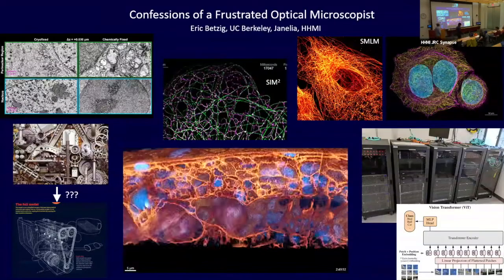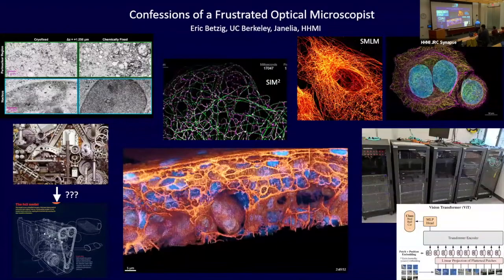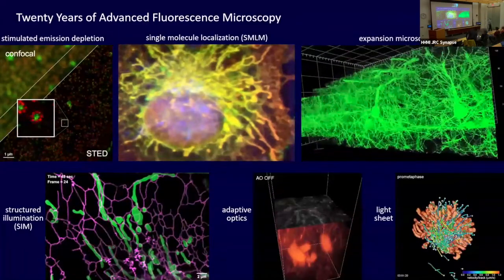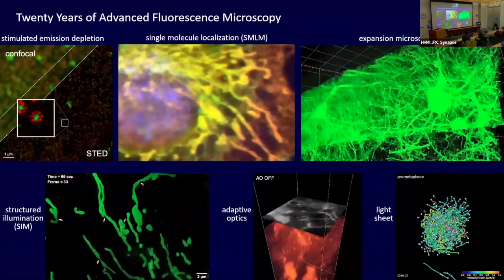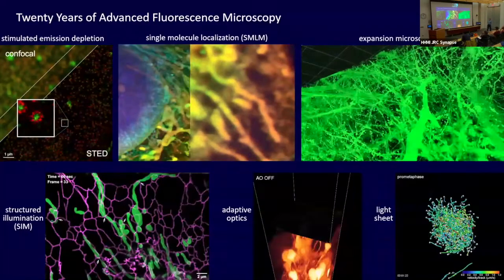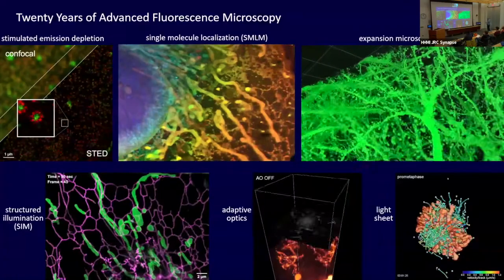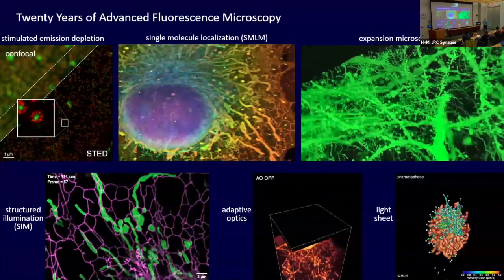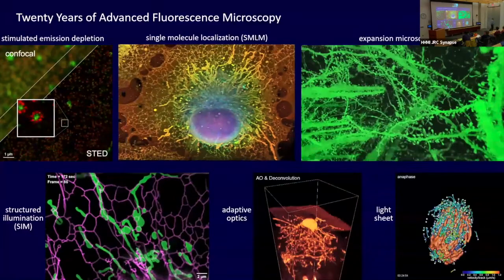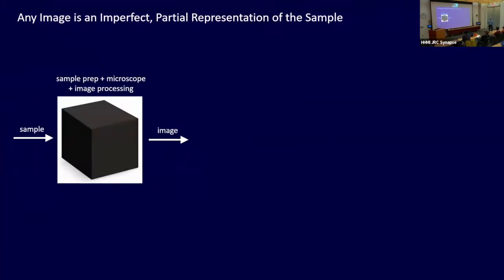Okay, thank you, Mark. We've been working with advanced microscopy now for about 20 years. Both light sheet and super resolution date from the early 2000s, and they're generally considered very impactful tools. I'm going to go through this talk and try to convince you that, in my opinion, they have not been. So what are the reasons for this?